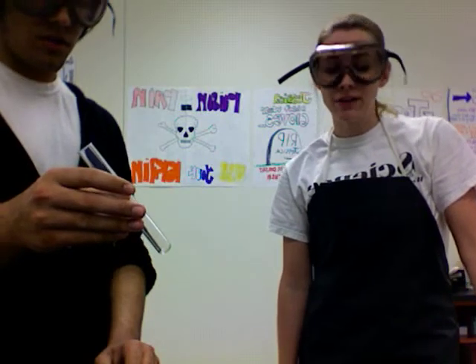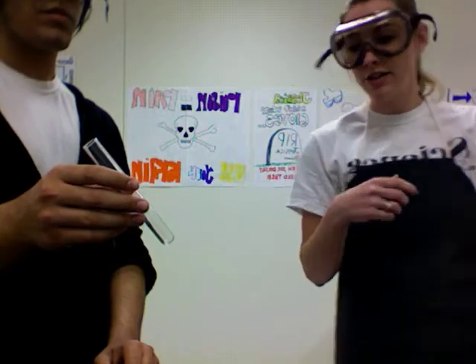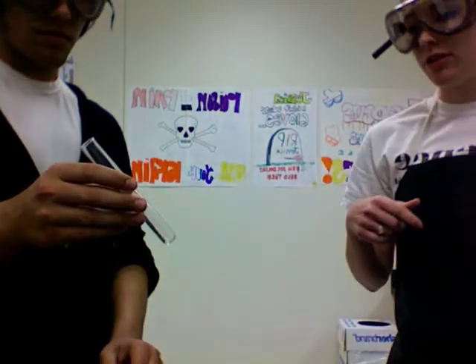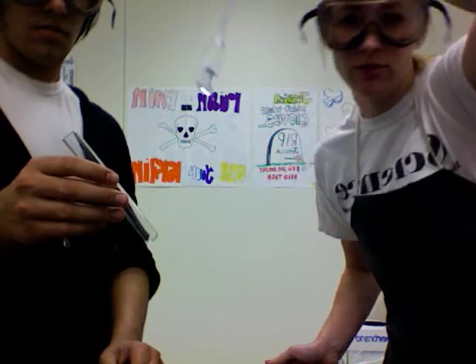The next reaction is going to be a very special type of double replacement reaction called a neutralization reaction. And we're going to take our sodium hydroxide, which is a clear liquid solution.